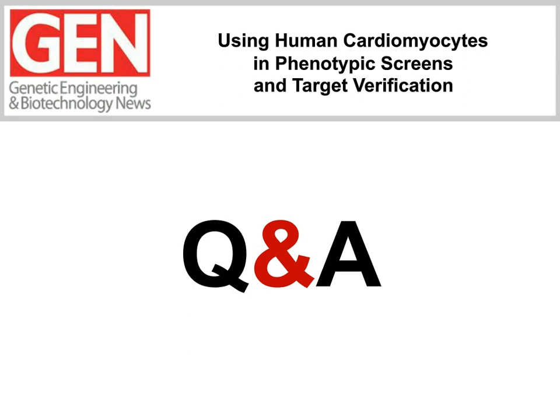Great. And Siobhan, the initial phenotypic screen hit on several compounds that resulted in mitochondrial protection. Are you pulling compounds out of the larger screen that have this same endpoint? And are other types of endpoint modulation, such as ER stress, being identified by the larger screen?